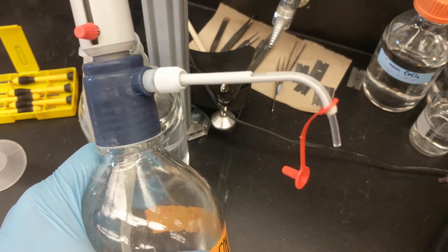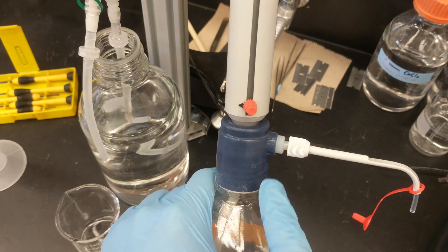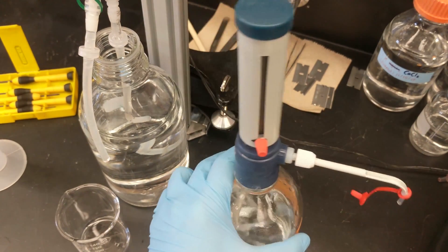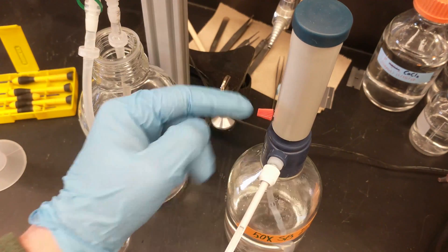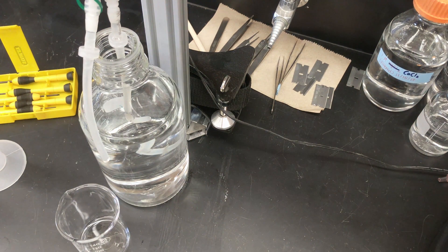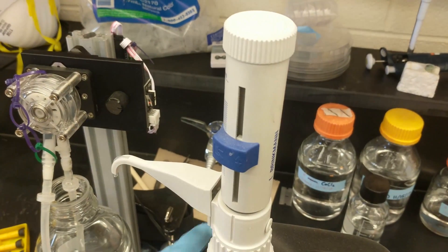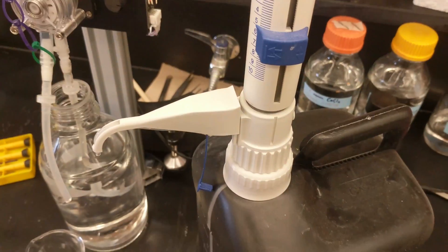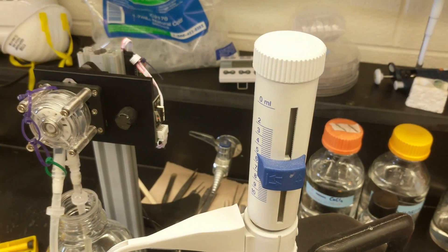These are quite nice, however anybody who's shopped for these knows that this one, this sort of basic model, goes for about 300 bucks new, just for this. A fancier model sort of like this guy, again 450 or more dollars easily.